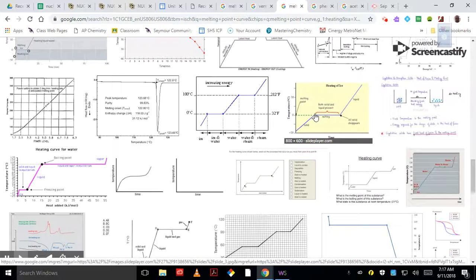You just heated it up. It sat there the entire time. You went up. When the last bit of the crystal in the tube is gone, you see why you don't want very much in there. Record that temperature, and that will be your melting point range.